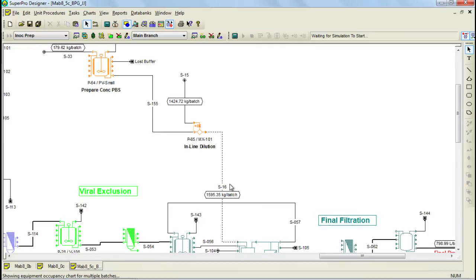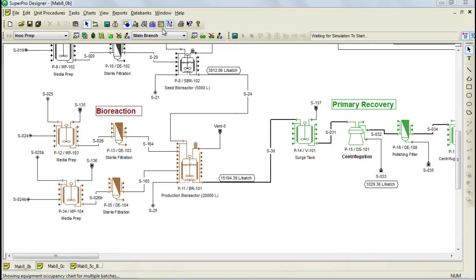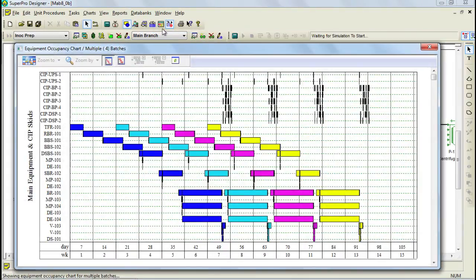As discussed in the first video, SuperPro Designer can be used for debottlenecking and cycle time reduction. Included with this example are various SuperPro Designer files and a README file that explain and analyze how to reduce the cycle time of a process. Cycle time reduction can be best explained by looking at the equipment occupancy chart. It's important to understand that the process cycle time is the time between consecutive batches — that would be the time from when we start the first batch until we can start our second batch. Please note that each color represents a different batch.